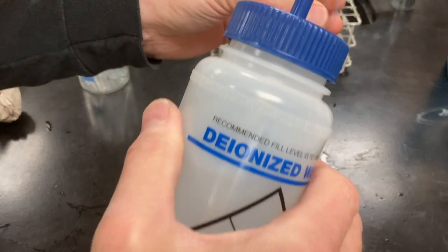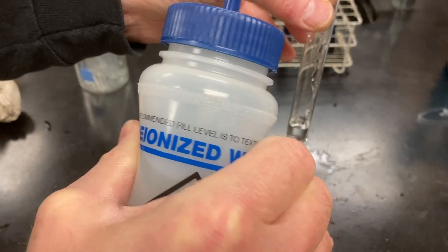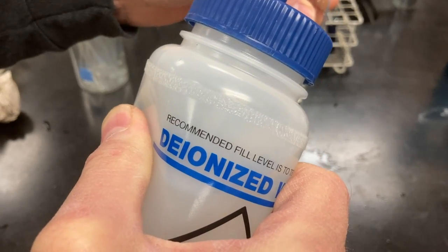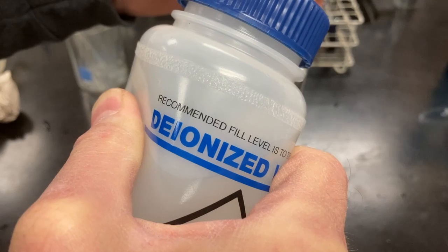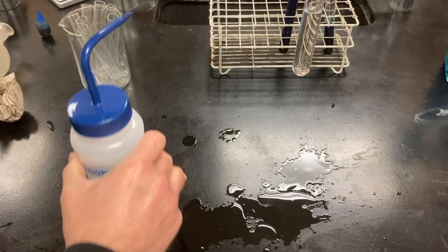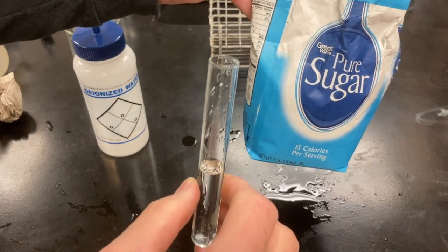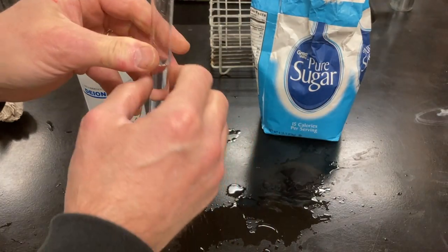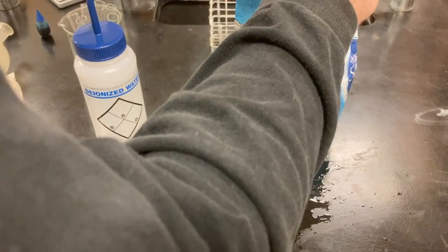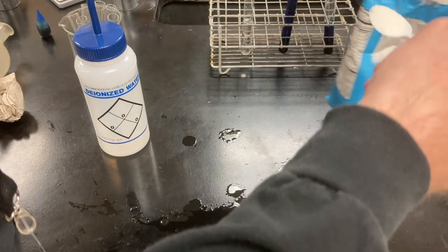I'm going to make another mixture. Again, I'm going to start out with water in the bottom of my test tube. Like in the previous example, I'm going to add a solid. So I've got some sugar here.